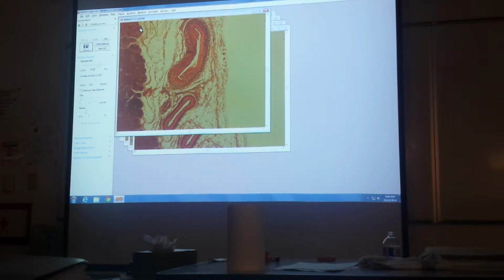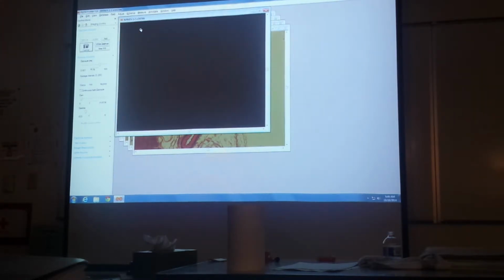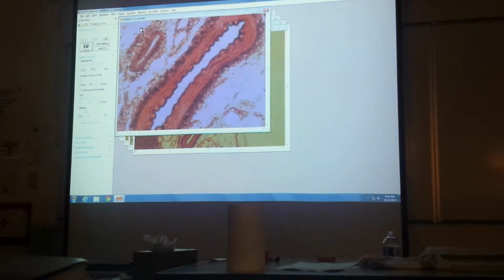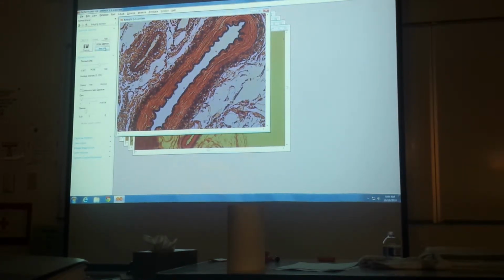Okay, let's look at the artery first. Let's talk about the tunics.